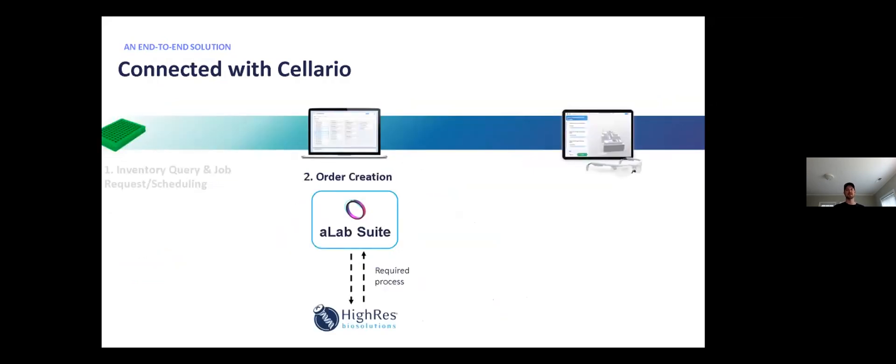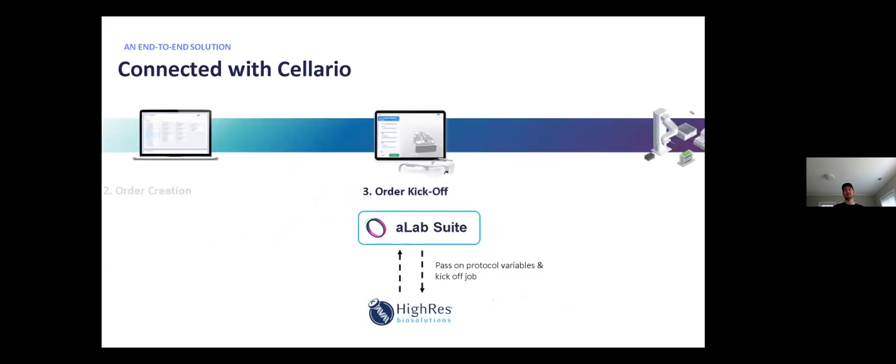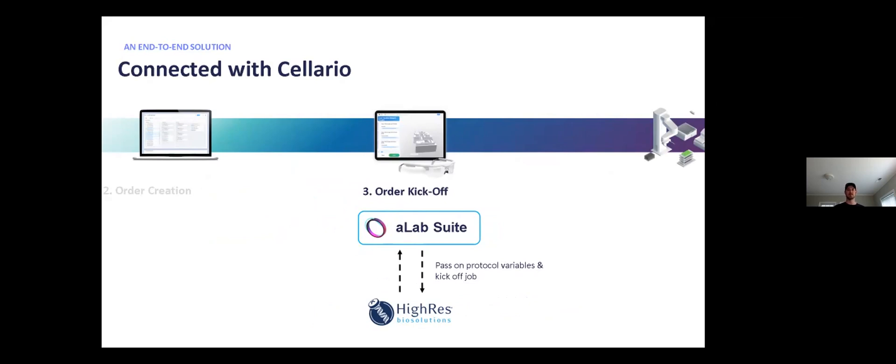Once the user confirms that the system is loaded, A-Lab Suite creates an order within Cellario, including the plate locations for this required process. After the order is created, A-Lab Suite starts the order on Cellario and passes along the relevant protocol variables. In Bob's particular case, we actually write a file to the host system that Cellario is running on and the process reads that file and that's how we get the protocol variables in. This isn't great and I'll talk a little bit more about that later.